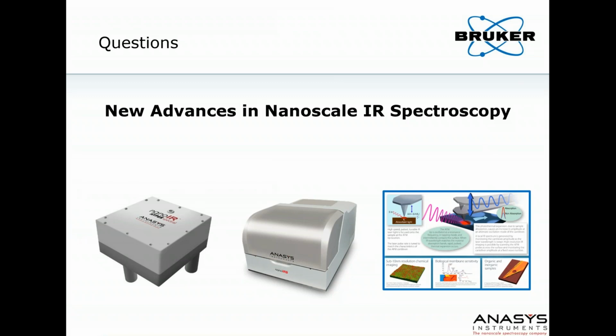Right. Yeah. So we are looking at trying to incorporate that type of concept into the Nano IR3 as a bottom-up only, so that it's sort of a newer generation, takes advantage of the 3 platform. But that's sort of a next year development. But it's definitely an area where clearly we're seeing researchers do work in fluid. There's lots of interest in it. So we're looking to definitely support that.